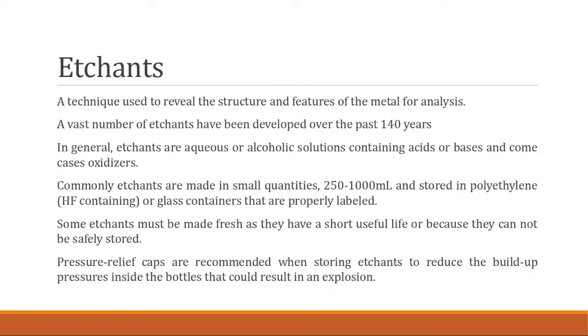Looking at etchants, obviously there's not just one etchant that's perfect for all materials, so there are hundreds of etchants. They all contain some type of aqueous solution with either a water or alcohol that has an acid or base mixed in.